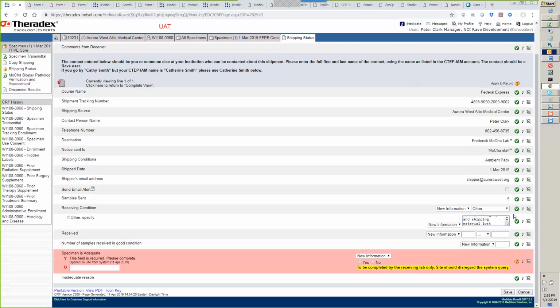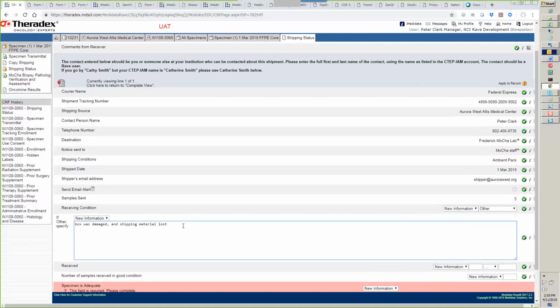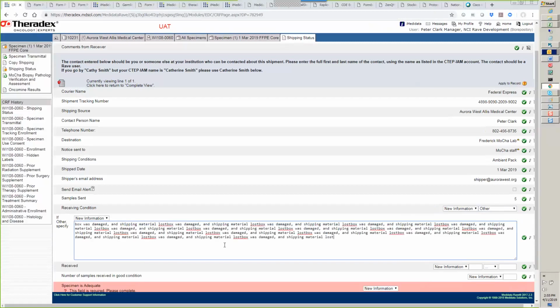Peter, is there a limit on the text size for that? There's probably some, I can't remember right now, but let's just see how much we can copy in here. So there's quite a bit of space. There's always going to be some limit.